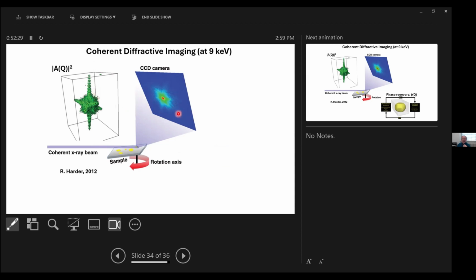So this gives you an idea of what an individual diffraction peak might look like on a CCD camera. This is just a bunch of images that you obtain by rocking the sample through a nominal Bragg peak position. Bottom line, the flux will be there for measuring coherent diffraction at larger energies, in particular with the high energy X-ray microscope, that long beamline in the end station.